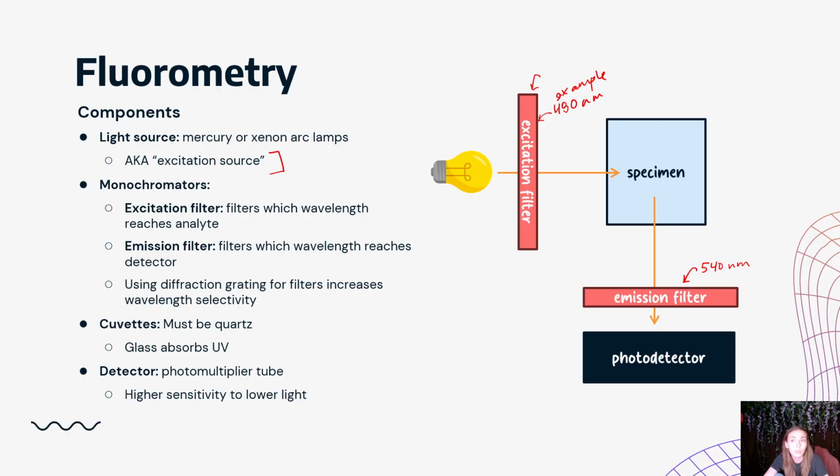Glass absorbs UV. So if we're putting UV light in initially and it's getting absorbed by that glass, that is now causing a problem because the glass in this instance is not going to fluoresce. It's just absorbing the light. And it's causing a really irritating problem because, again, computers are stupid. So if we have loss of light that is not caused by the specimen, it's caused by something else, the computer doesn't know that. It causes problems because the computer is like, well, where'd all the light go? Well, it must have gone through the specimen.